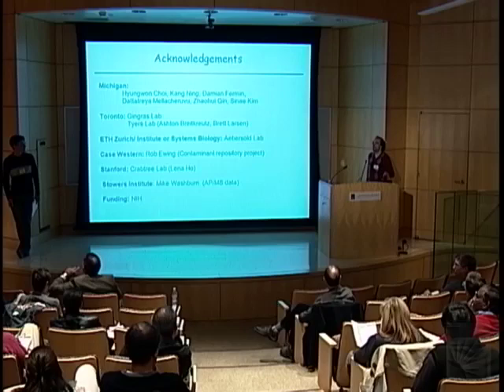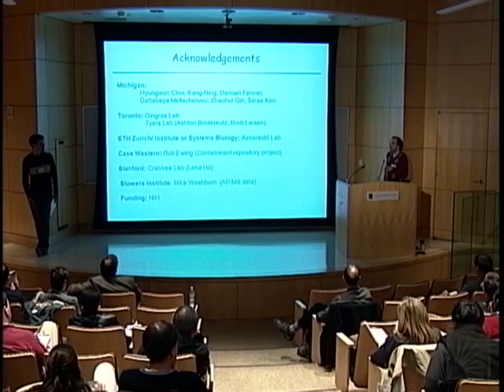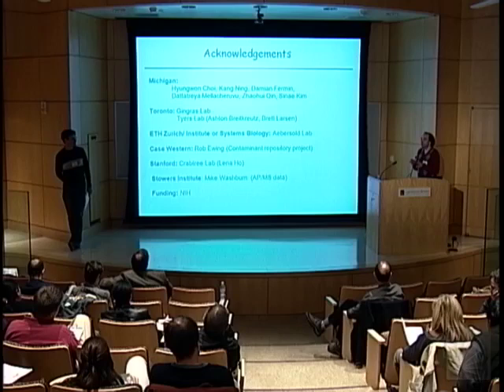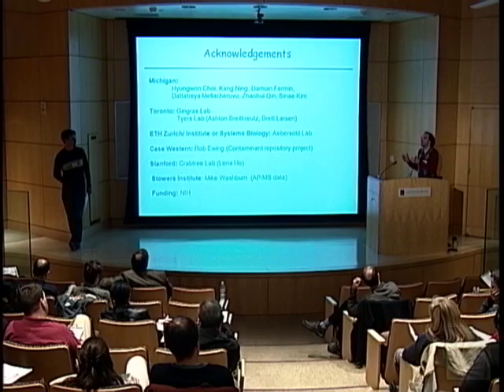You mentioned that a Poisson distribution for your spectral count was appropriate to determine the abundance of the proteins. Could you explain that? Well, not to determine the abundance of the protein, but the model, the expectation of how many spectra you would expect to see for that protein, given a certain abundance. That can follow a Poisson distribution that's centered around a mean abundance factor for that protein, which roughly represents the abundance of the protein in the sample. Have you thought about using some parametric or bootstrapping methods?